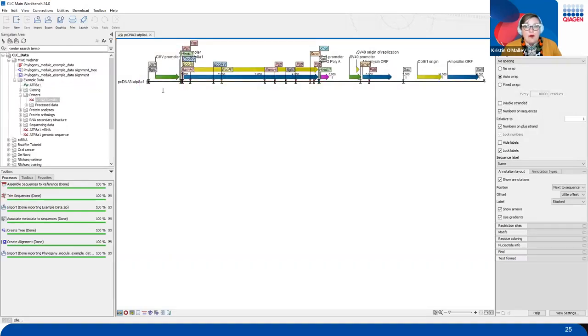On the black line that shows up below these annotation arrows, we can highlight the section that we would like to stick this primer in. So let's select this area on this line to pop the forward primer in. You'll see that the selection turns bluish purple.